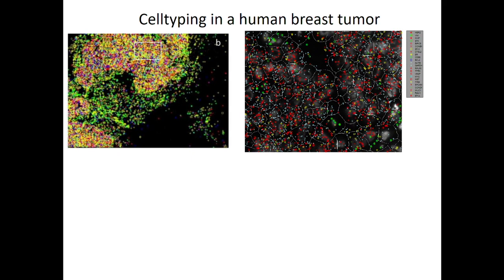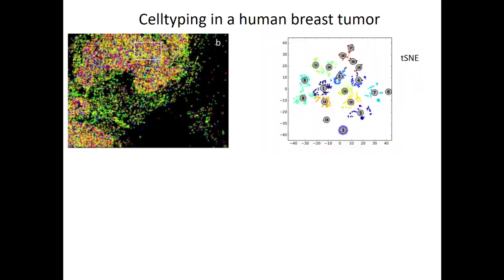So the approach we're taking here is, just based on the DAPI stains, expand the DAPI, the nuclear stain, until it hits another expanding cell, and then define that as a cell. That's of course a very crude guess of the extent of a cell, but it gives at least some approximation of a cell. And then we measure the in situ RNA content and cluster.